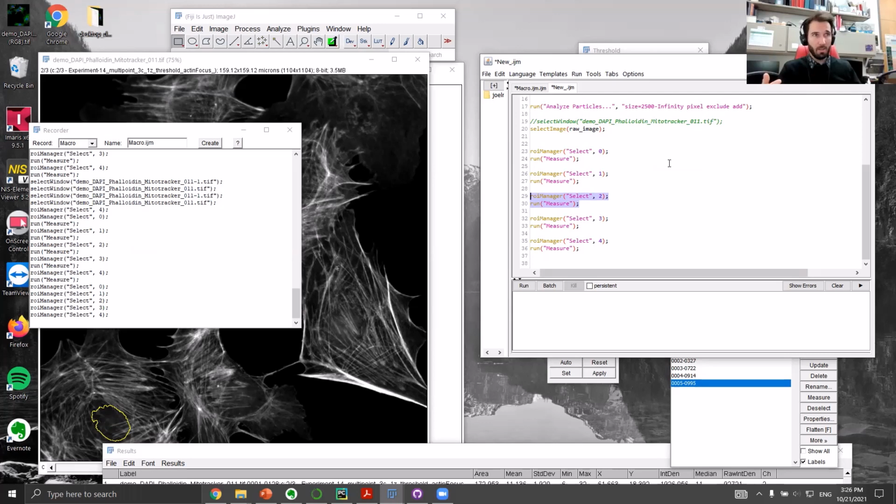We don't want it to fail based on the number of objects there, and we don't want to have a fixed recording of number of objects. So we need to figure out something for this. And for this type of work, this is a standard programming expression that we will write and unpack. It might still be a little bit unintuitive at first, but you'll gain an understanding of it. Essentially, we want two things.